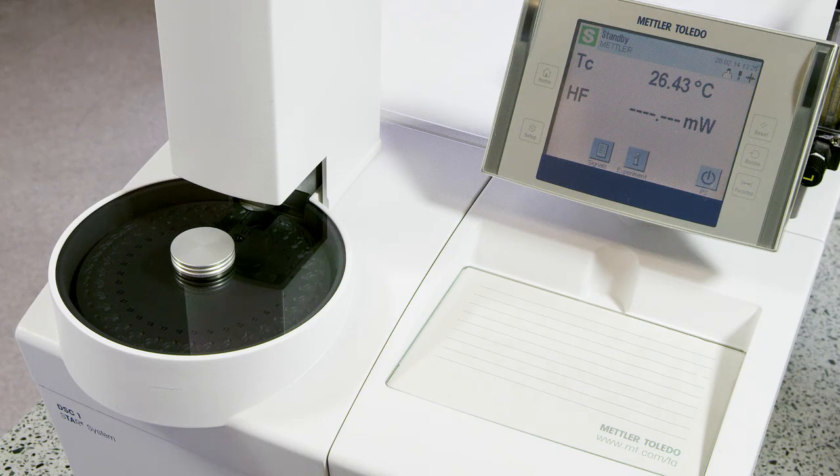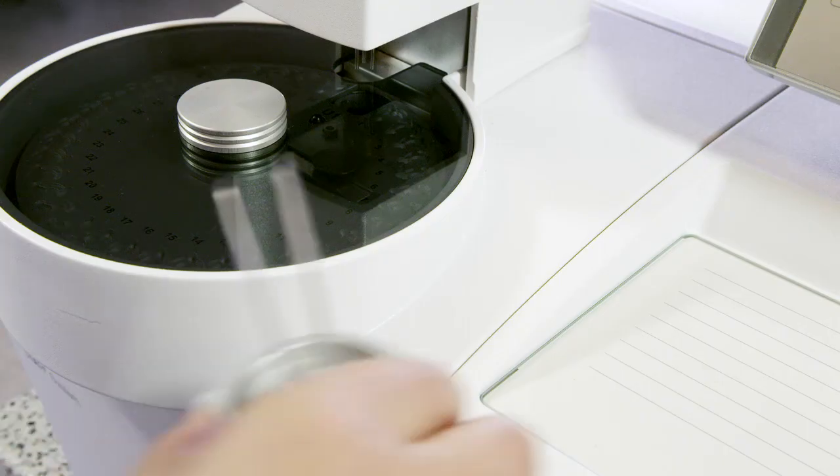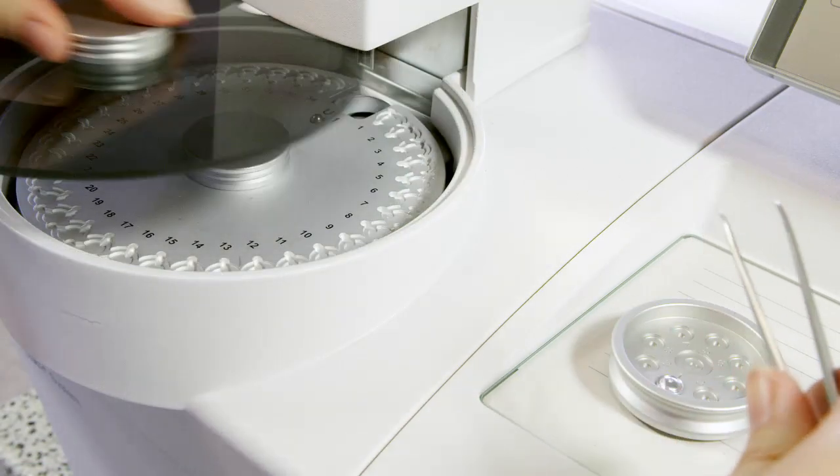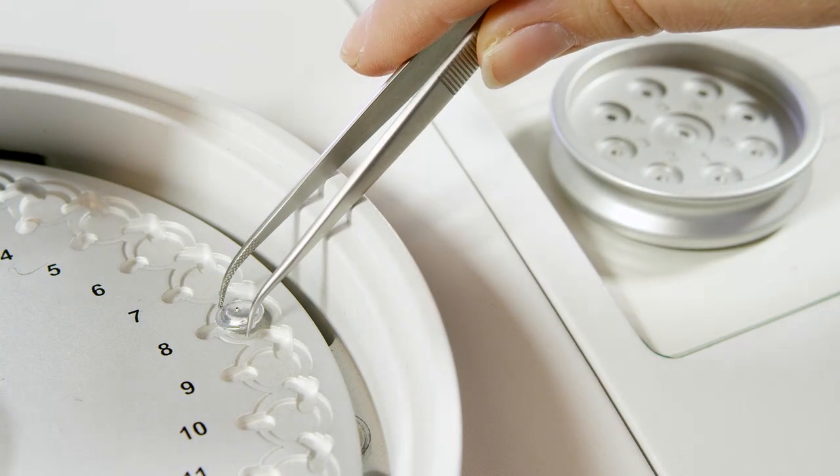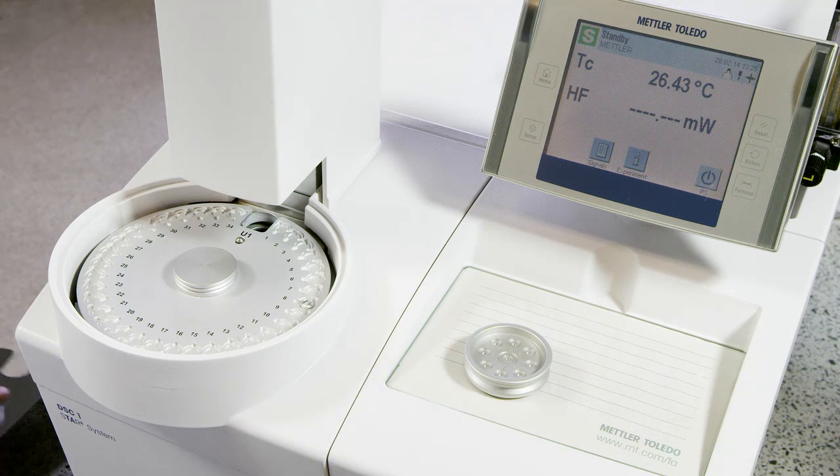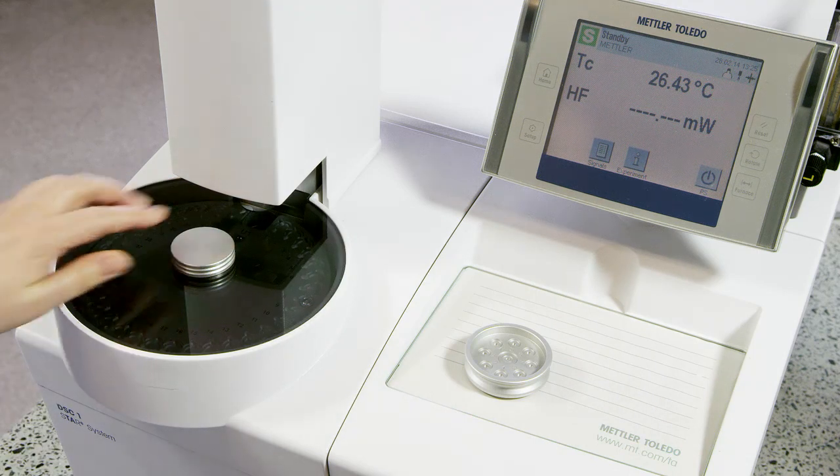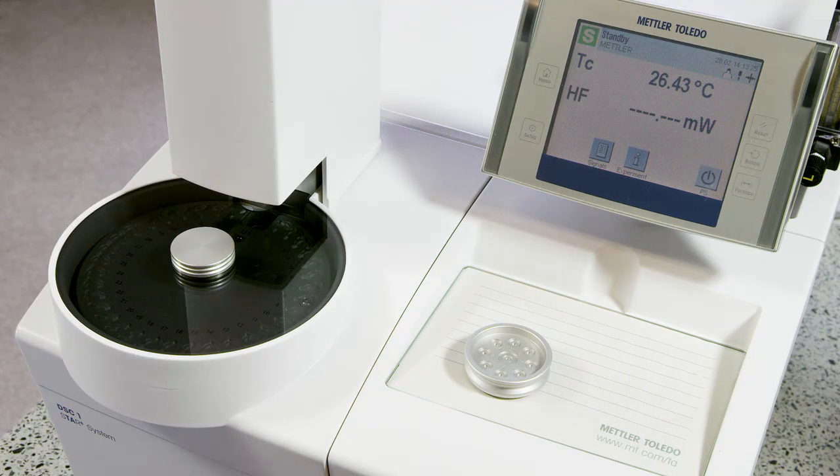Place the crucible support near the DSC and open the sample changer cover. Using tweezers, place the crucible containing the indium sample on a position of the sample changer tray. Make sure that an empty reference crucible is already on the reference side of the sensor.